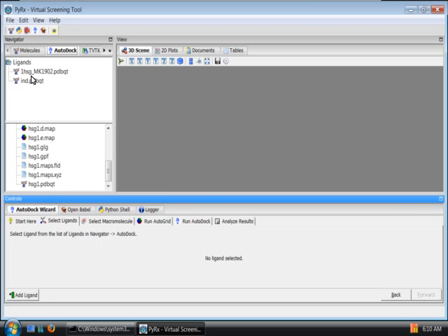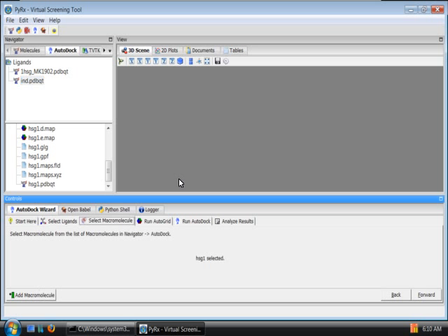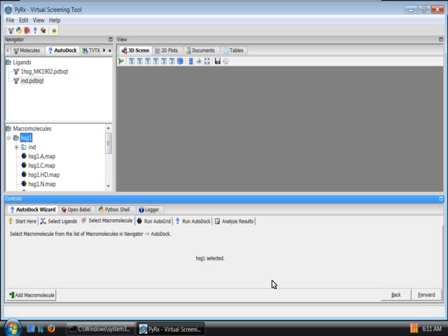Here I'll need to select the ligand. I'll select this one. Click Forward. Select the macromolecule. Click Forward again.